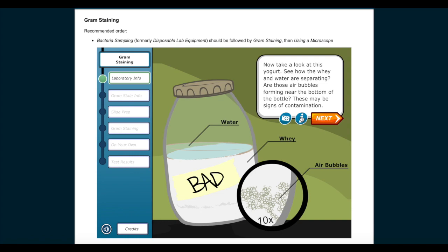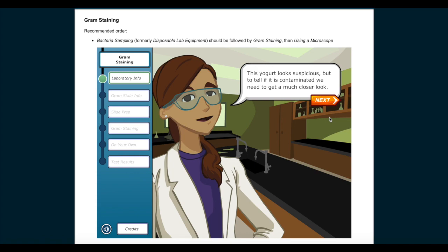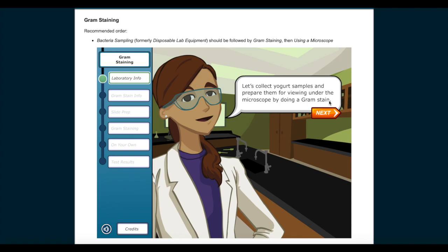Why are air bubbles a sign of contamination? When bacteria grow, they produce gases. Air holes appearing at the bottom of a yogurt container indicate the presence of an undesirable bacteria. This yogurt looks suspicious, but to tell if it is contaminated, we need to get a much closer look.